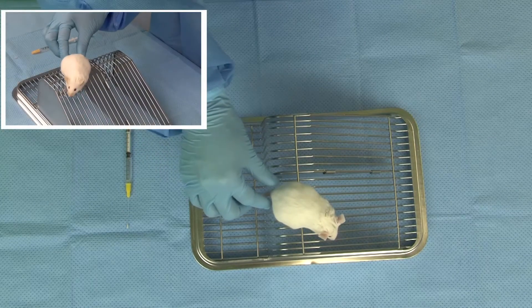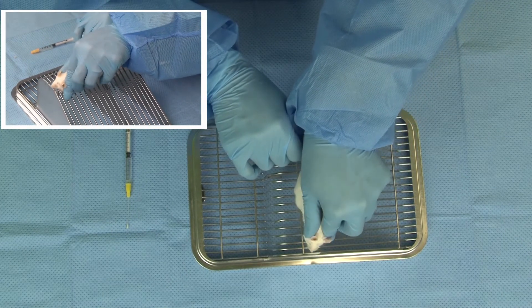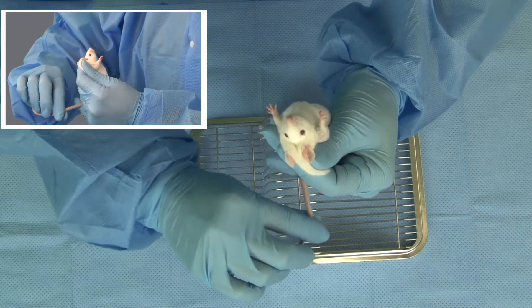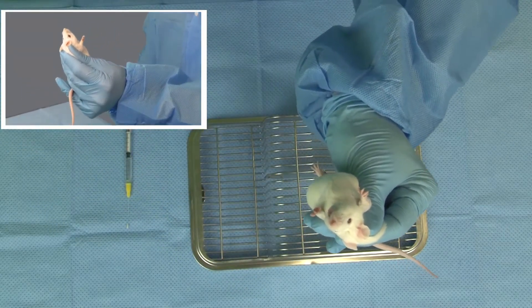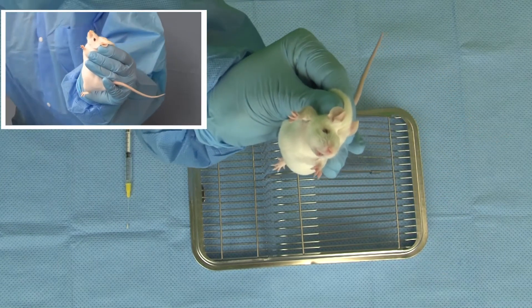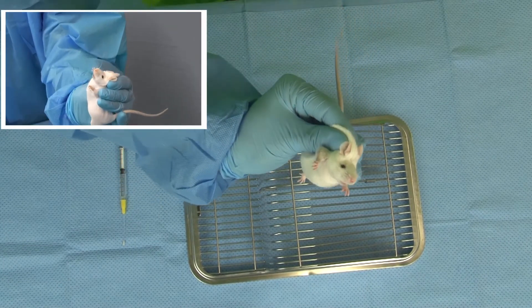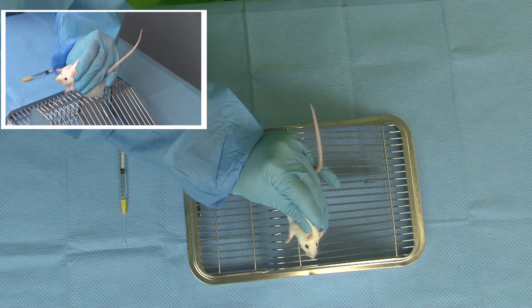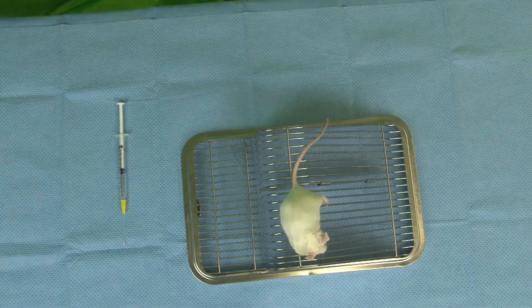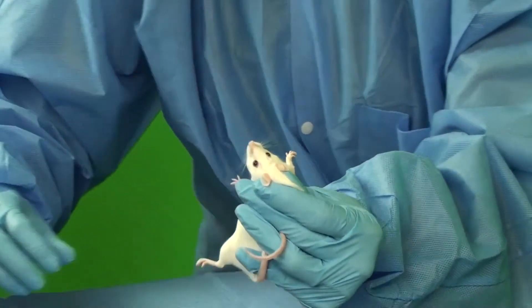Here we have an alternate two-handed restraint technique. Gently but firmly grasp the mouse by the base of the tail with one hand, while using the other hand to grasp the mouse by the scruff at the nape of the neck. The thumb and index finger will be used to grasp the scruff as in the previous technique. Here we see the technician wrapping the tail around her fingers from a different angle.